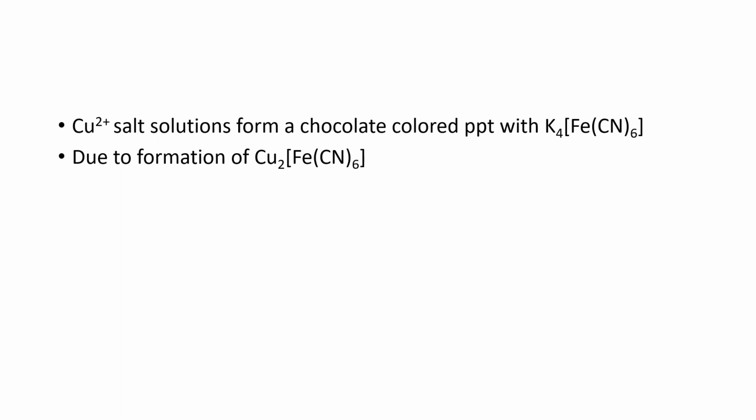So these were the metal ions that we have considered of the first transition series and the tests that can be used for their detection in the laboratory.